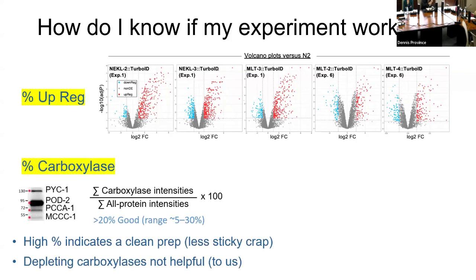So this was percent carboxylase. This is something I actually ran by Dennis and Rick and a few at Sam, I think. You guys took the time to meet with me. So here's the idea, and I haven't heard anyone else talk about this before. These are those endogenous carboxylases that I talked about. They're the ones I was worried would just swamp out everything else.